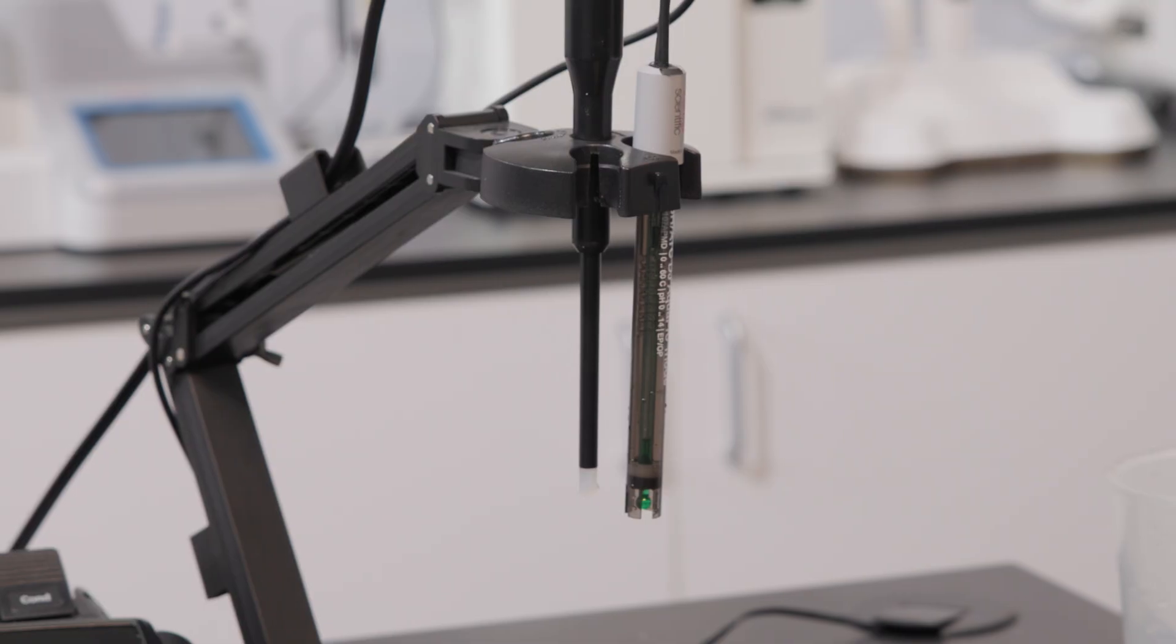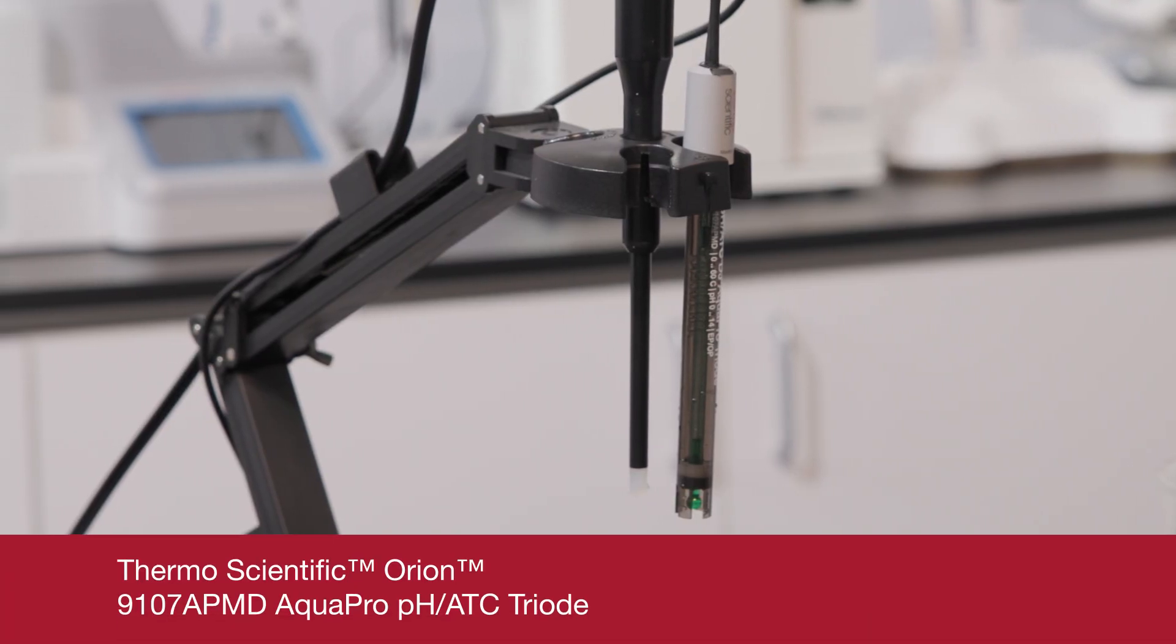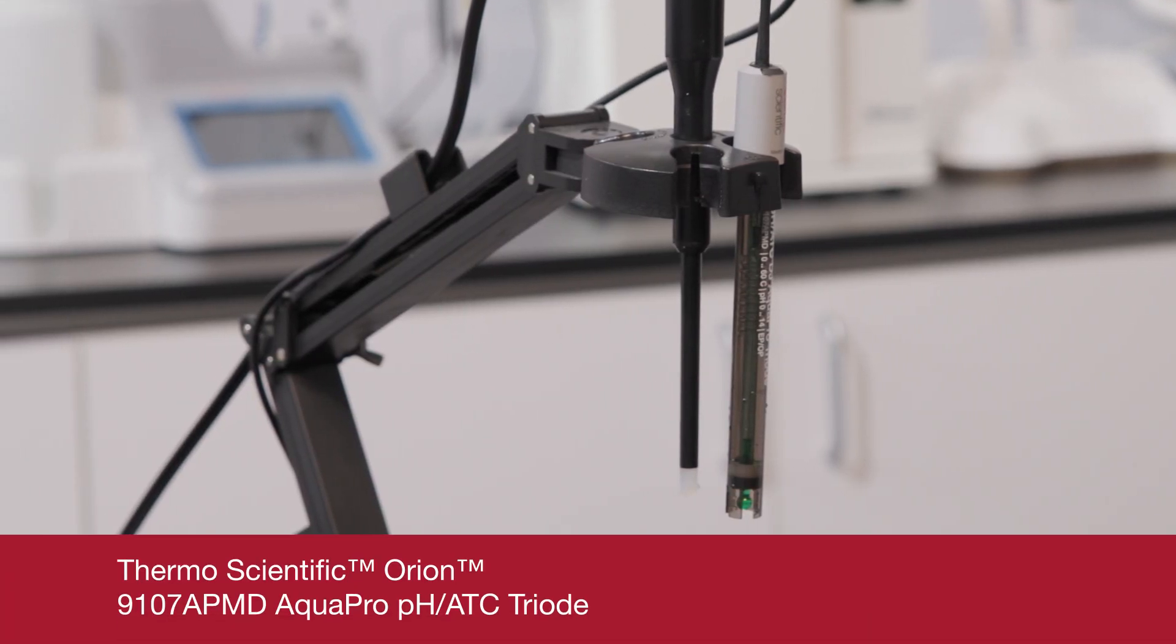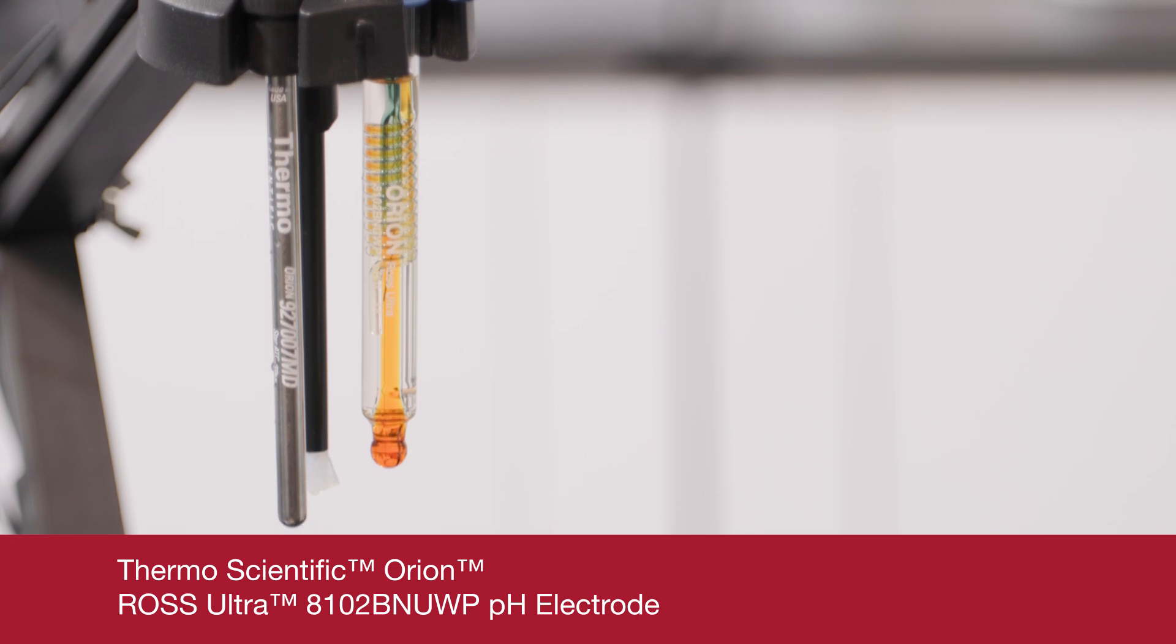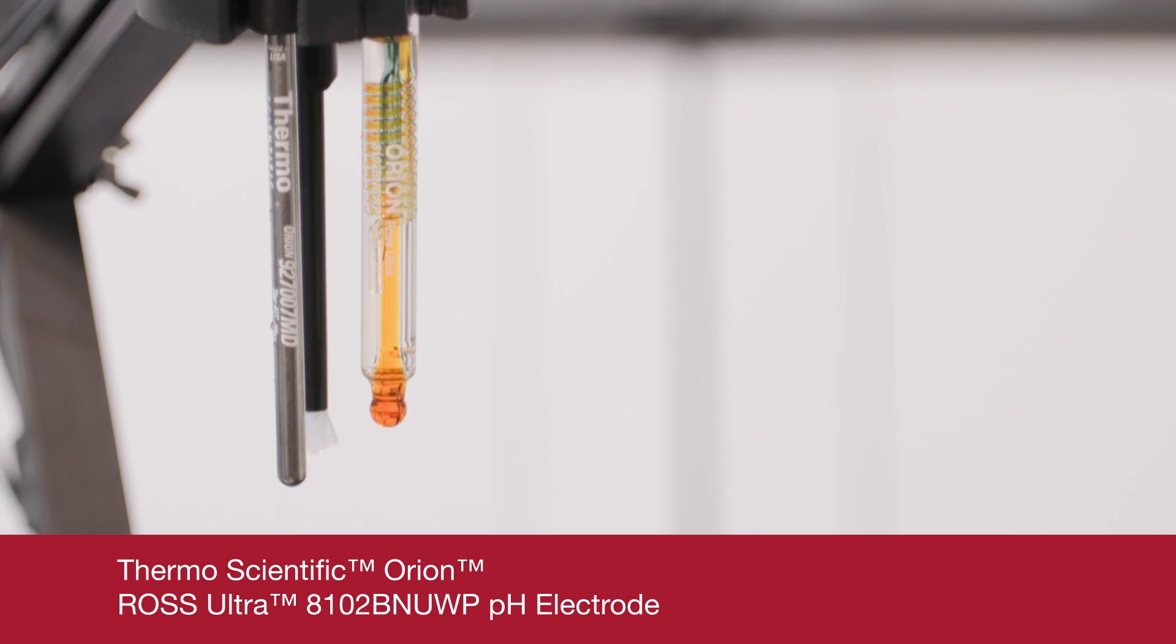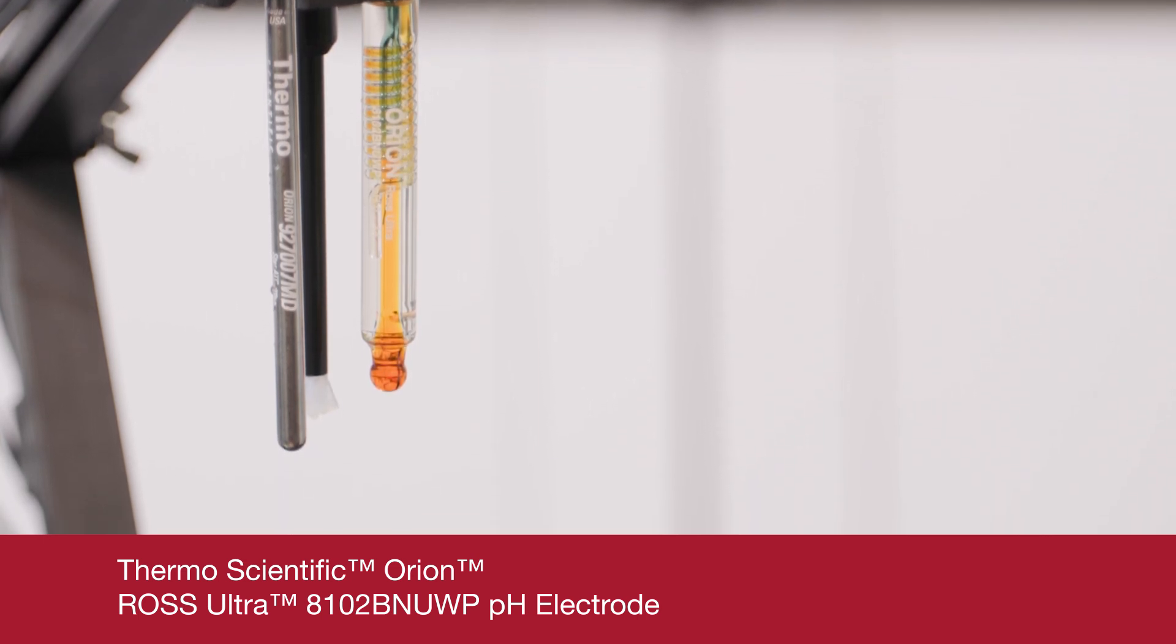The body material of an electrode also has a big impact on durability. Epoxy body electrodes are generally robust enough to protect the pH bulb and are a good choice for the field or production floor. Glass electrode bodies may seem more fragile, but they're resistant to most chemicals and are often required for use with petrochemical or solvent samples.